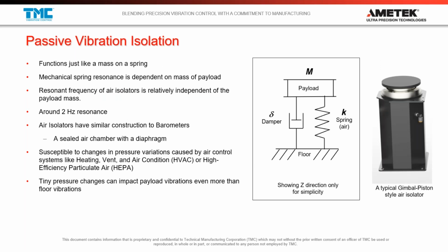Commercially available passive isolators are oftentimes air isolators. So it's a sealed chamber that functions just like a mass on a spring. And what makes an air isolator, or a pneumatic isolator, unique is that it functions sort of like a barometer. It's a sealed chamber, you feed an air pressure into it and it floats a piston. And that piston floating on air is a very, very strong isolator at high frequencies. But it being a soft spring, it's also going to have a very, very strong resonant frequency at roughly 2 hertz.